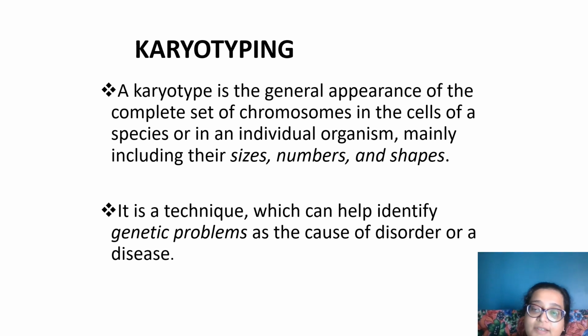The cytogeneticist has the capability of recognizing which pair of chromosomes is chromosome number 1, which is chromosome number 2, as per the color or the width of the bands on the entire chromosome. So it is possible to see chromosomes under a light microscope. Initially, the entire set of chromosomes, the 23 pairs, when you put it on a sheet, is known as a karyogram. Initially, it was done purely by clicking pictures on the microscope, then cutting out individual chromosomes and pasting them on a chart paper. Now we have software, platforms, and cameras to do it for us.